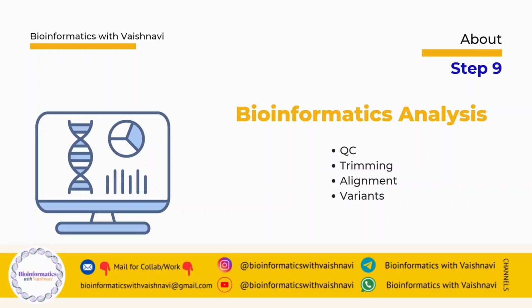So this is where bioinformatics comes in. Bioinformatics analysis includes quality control of FASTQ files, read alignment to a reference genome, variant calling, and data interpretation. Bioinformaticians convert raw sequencing data into biological insights. Without bioinformatics, NGS data is just large files with no conclusions.